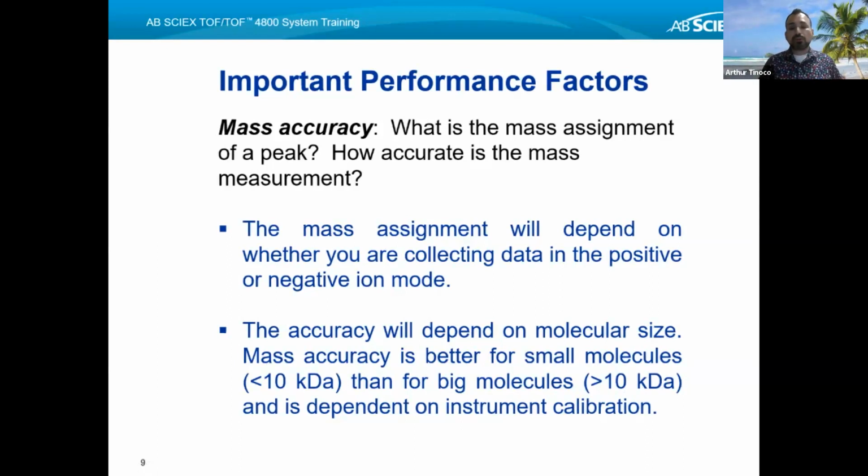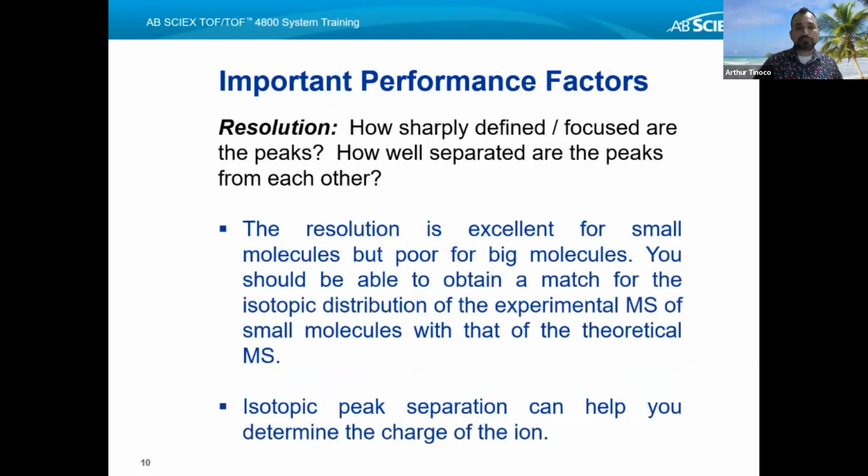All right, so you will see that we will use different modes depending on whether we're collecting things that are small molecules or whether we're collecting things that are big molecules. All right, so the resolution. Here, I already jumped the gun a bit by saying that the resolution is quite strong when you're working with small molecules, but it's extremely poor for big molecules.